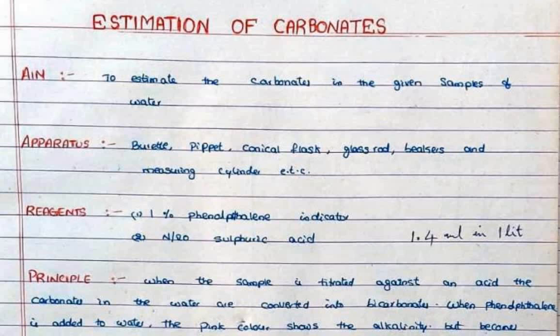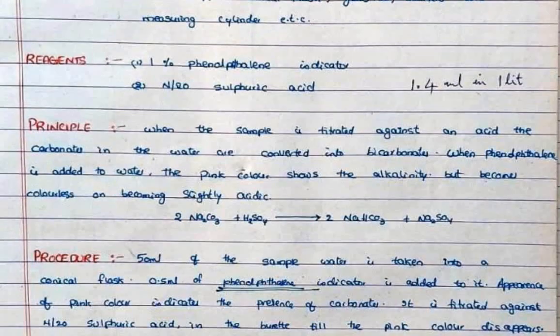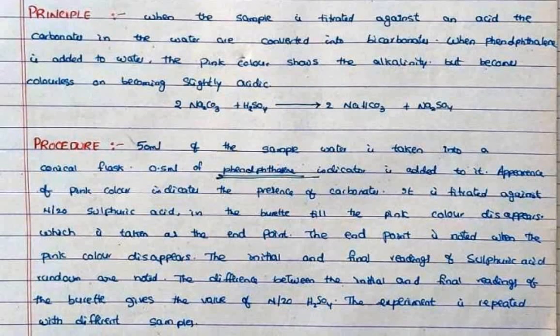Next, reagents: 1% phenolphthalein indicator and N/20 sulfuric acid.